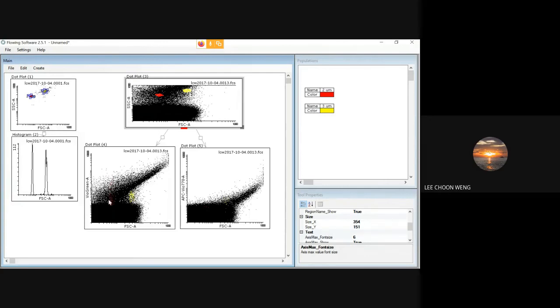You have a lot more signal for the cyanobacteria, for the Synechococcus, relative to the Prochlorococcus. This is the red part, so this is 2 micron and below. Okay, so most of the quadrant here is all noise.